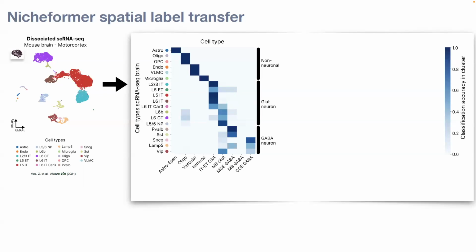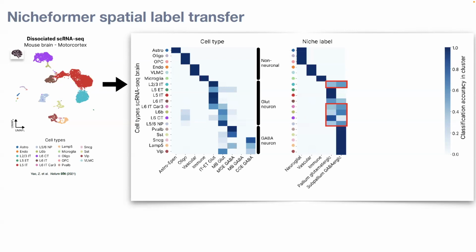There are some outliers, which I will also tag, but overall you see the astrocytes are mapped quite nicely to the equivalent, and for the non-neuronal cells, it's quite obvious to map their cell type. I mean, it's obvious how we define a cell type in the first place, but we looked at the second step. So there it's more complex.